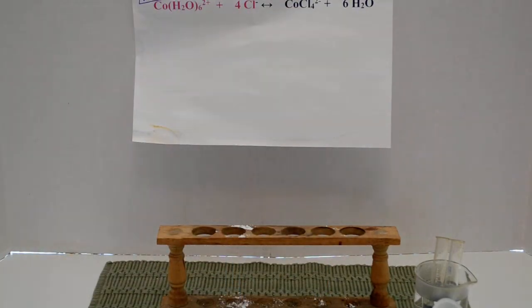Okay, assistant, I need my acetone. That's the one with the red cap. Red cap, this one? The red cap one, yep.